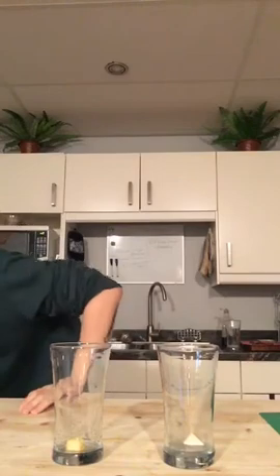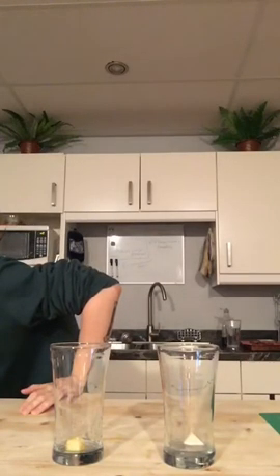So the potato has a rate of reaction of 1. The apple, 0.